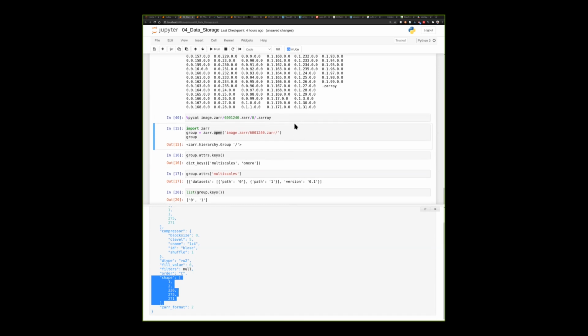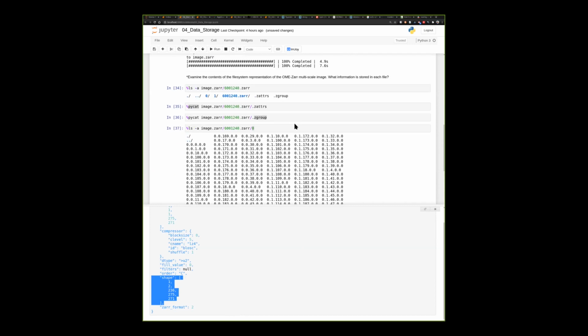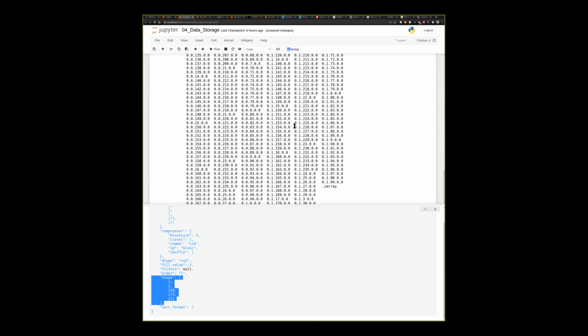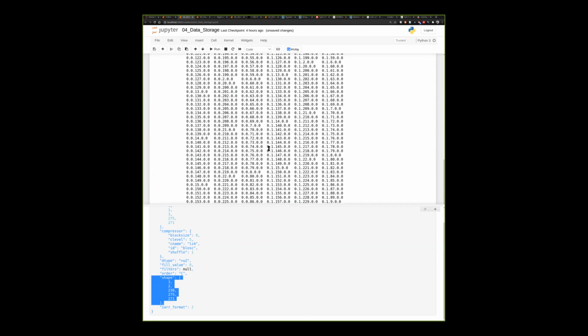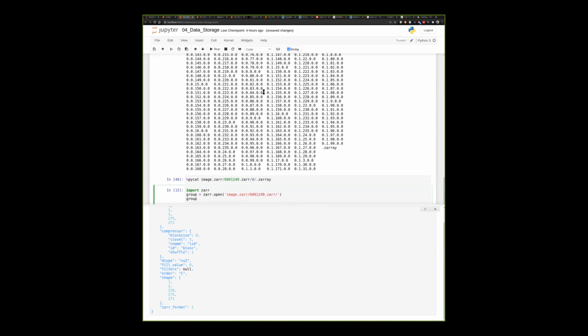So any comments or questions or thoughts there on how Zarr is stored? This is what they call the file system storage backend. We can read that by just putting the path to the folder. Zarr also supports taking all this folder hierarchy and files and zipping it into a single zip file and then reading the file that way.